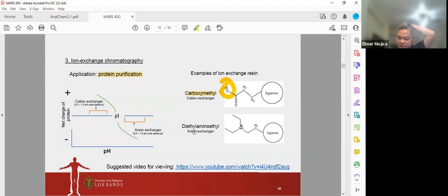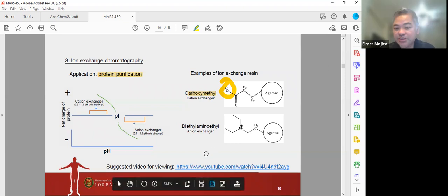Now, if we want to target a negative ion, or the anion, one example that we have here is the diethylaminoethyl. Okay, so I would suggest you watch the video that is attached here.